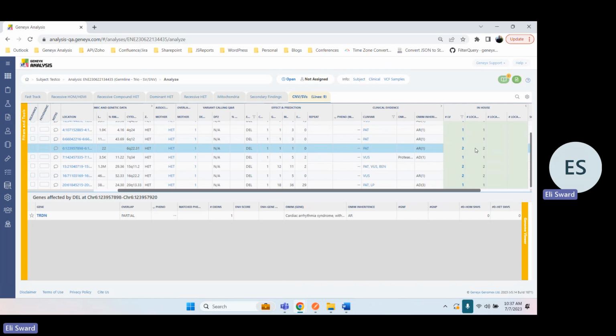And so, ideally, if you are looking for relevant CNV events, you would want to eliminate those that are commonly observed in other samples. And so in this example, we are filtering to basically have a local variant frequency under 10 observed events in other samples. And we're getting down to 9 events. And you can see we also have some classifications being pulled in from ClinVar.